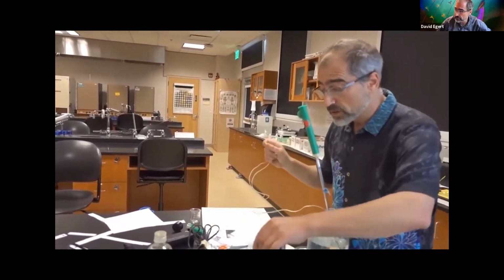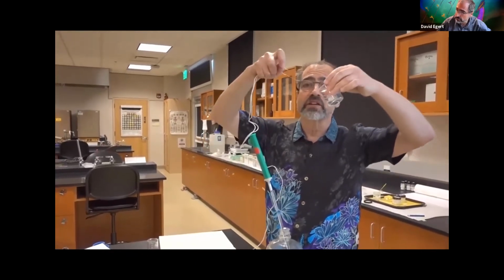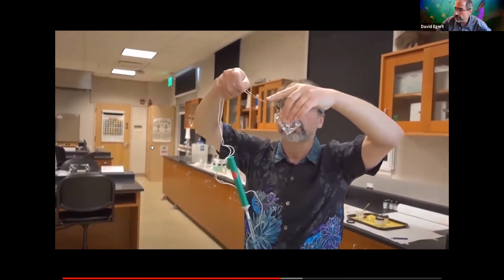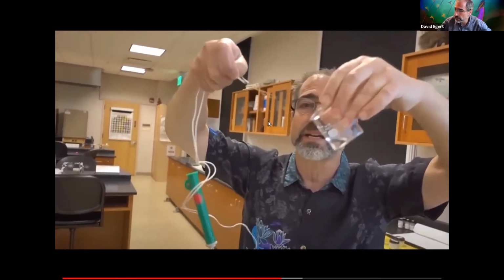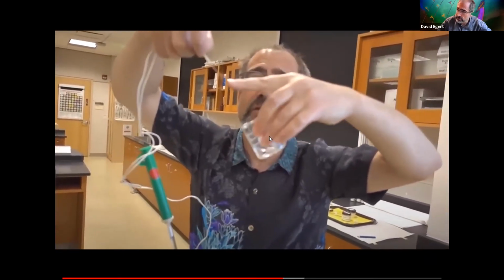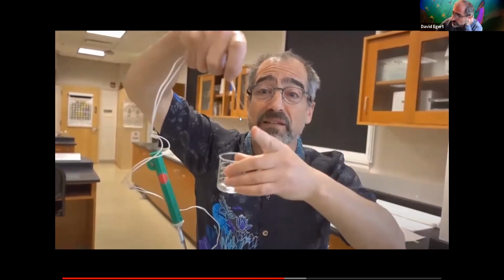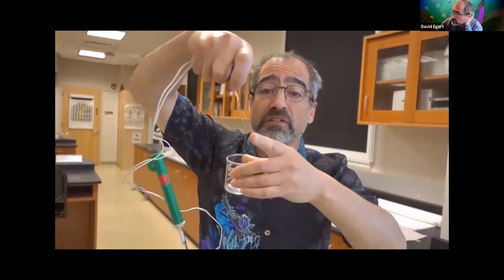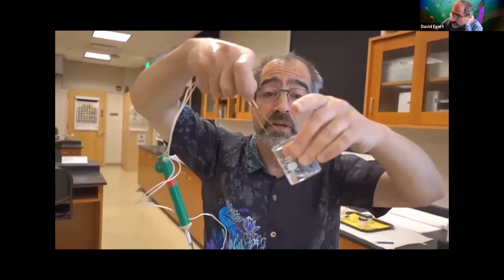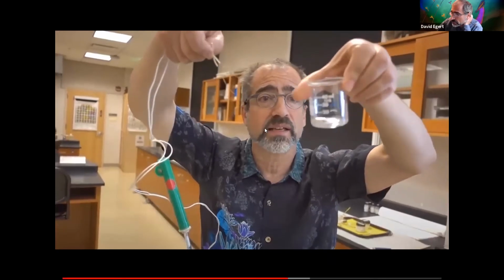I can take one of these solutions, and again, these wires are not touching, but if I put the solution flooding, so both wires are underneath and submerged by the solution, I can see if I hear the buzzer going. And when you do this, you want to make sure that the wires have a lot of surface area in contact with the solution. If you just barely dip their noses down, there's so little contact, you're not really going to get a good answer. But here, I'm going to put them in. This right here is the calcium chloride.